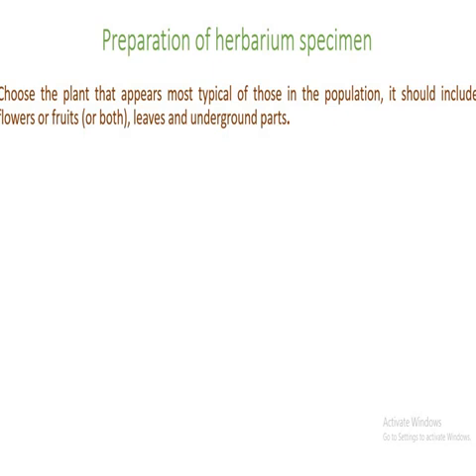Those two, particularly the flower, is sufficient for identifying the particular specimen. So ensure your plant specimen that you're collecting has the flower with it. But I'm not saying you just collect flowers. Ensure the flowers and the leaves and, if possible, underground parts are present. If you have a plant specimen that does not have the flower, it becomes difficult for one to identify the plant. So we'll say you have collected a sterile specimen.